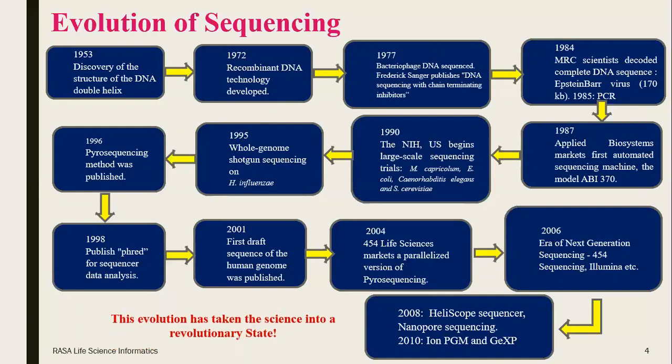Okay, over the years, innovation in sequencing protocols, molecular biology, and automation increased the technological capabilities of sequencing, while decreasing the cost and the toxic chemicals, allowing the reading of DNA hundreds of base pairs in length, massively parallelized to produce gigabases of data in one single run.